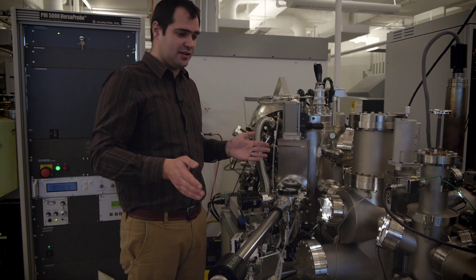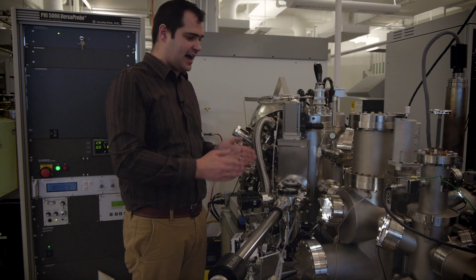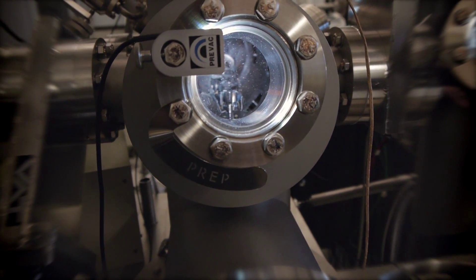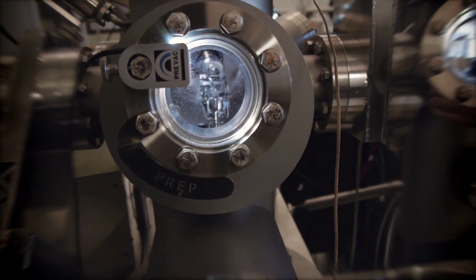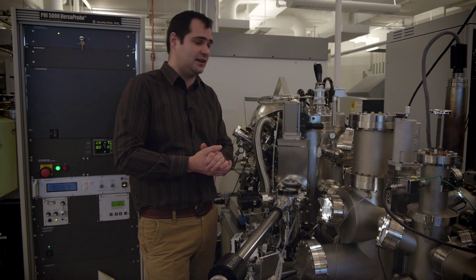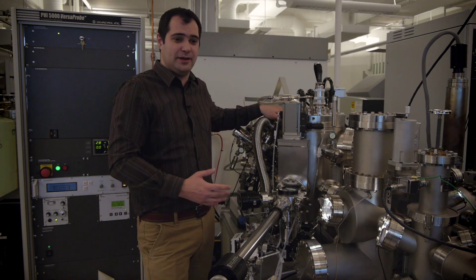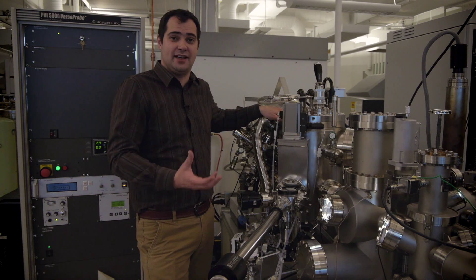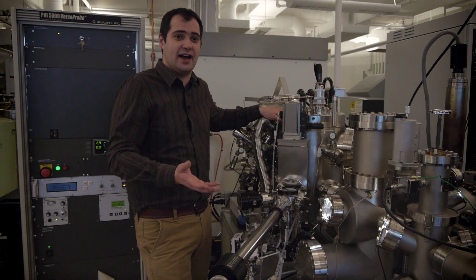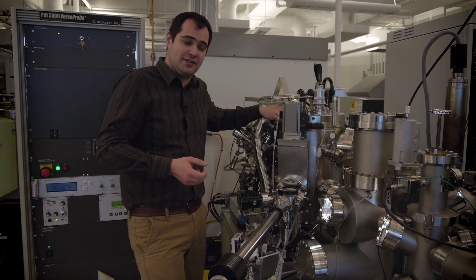This particular piece we have added on is a dedicated surface preparation chamber. As I mentioned, we are measuring photoelectrons that primarily come from the topmost layers — in this case, the effective probing depth is something like 5 nanometers at most. We can make it more surface sensitive, but we are limited to that topmost 5 nanometer region.